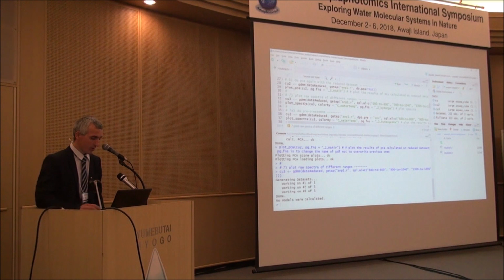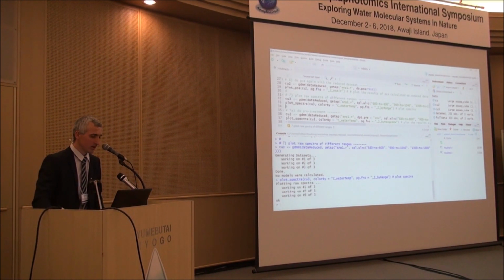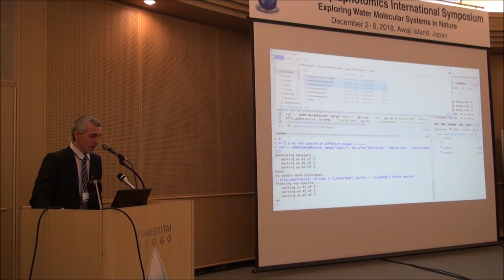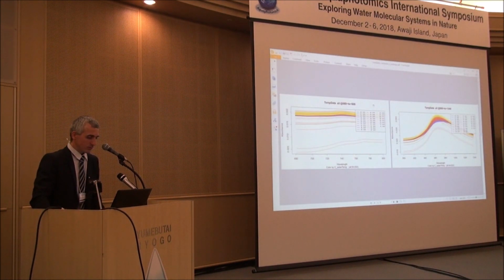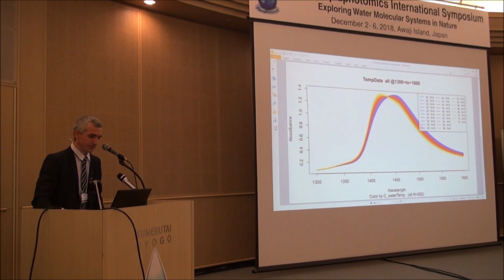And then now we can, for example, look at the raw spectra zoomed in to, for example, the first, second, and third overtone of OH. So now in the results folder, a new PDF file appeared showing the third, second, and first overtone range of your data set.